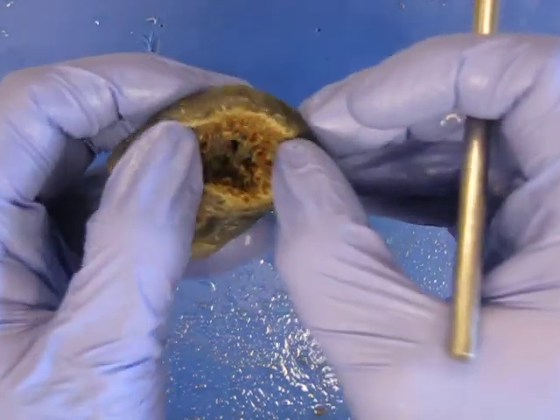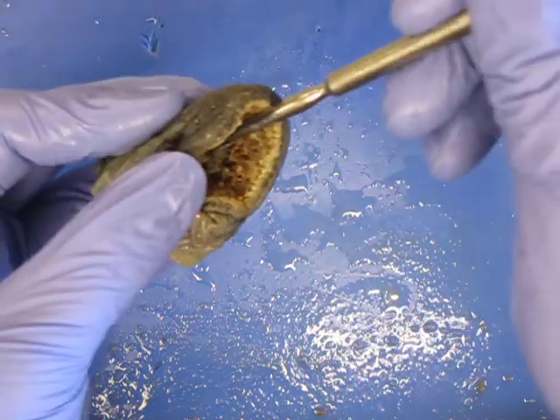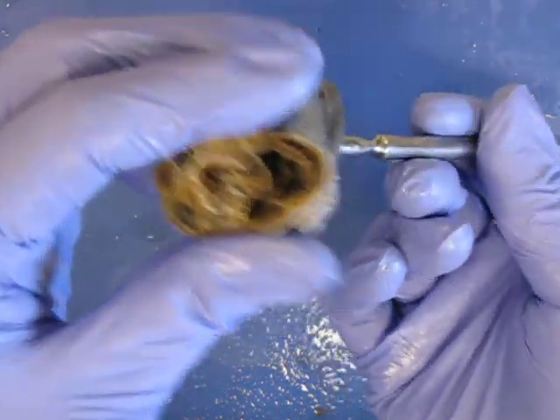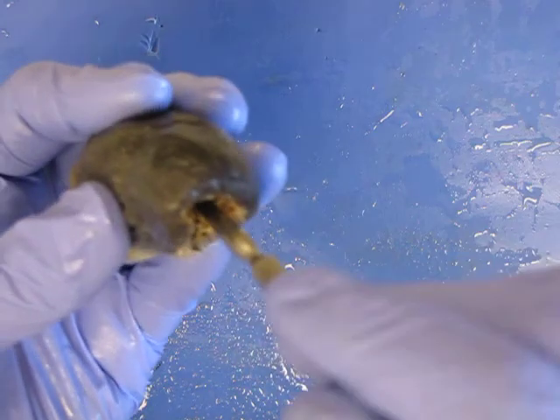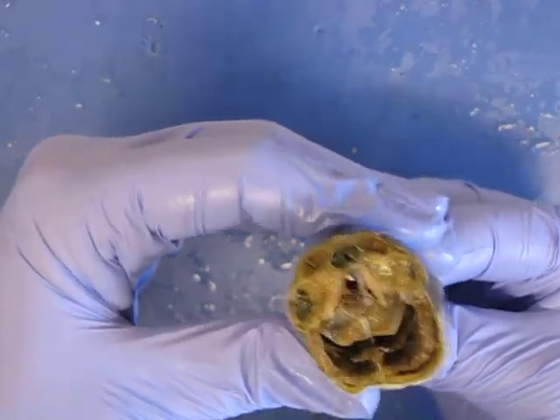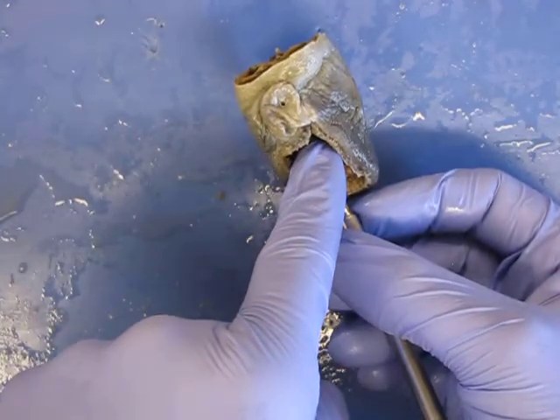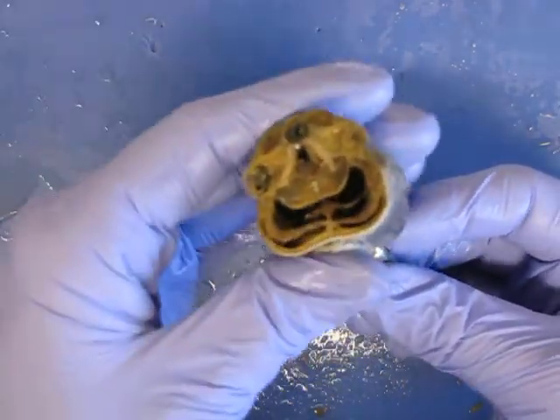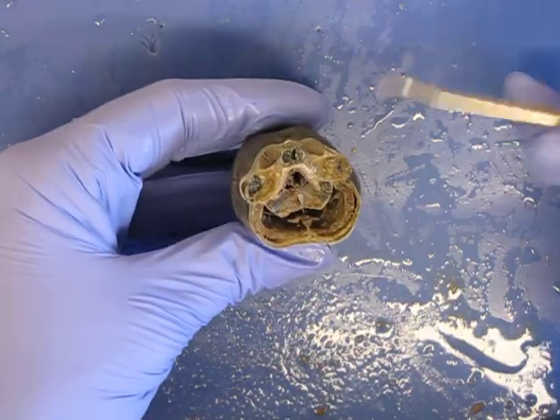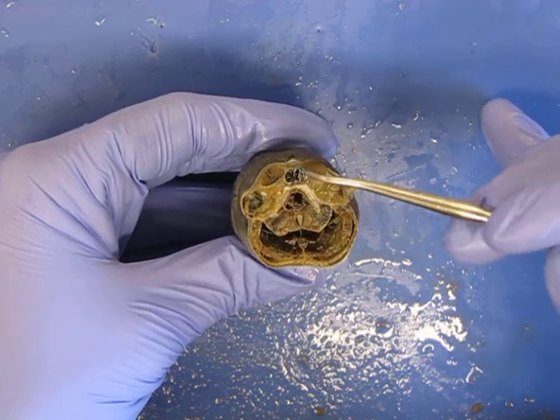So if I go through the mouth and oral cavity here, usually if you take your probe and you very gently move it along, you'll eventually see it come out there. So you can see how the oral cavity and mouth leads to the pharynx here. So that's the pharynx area, okay.